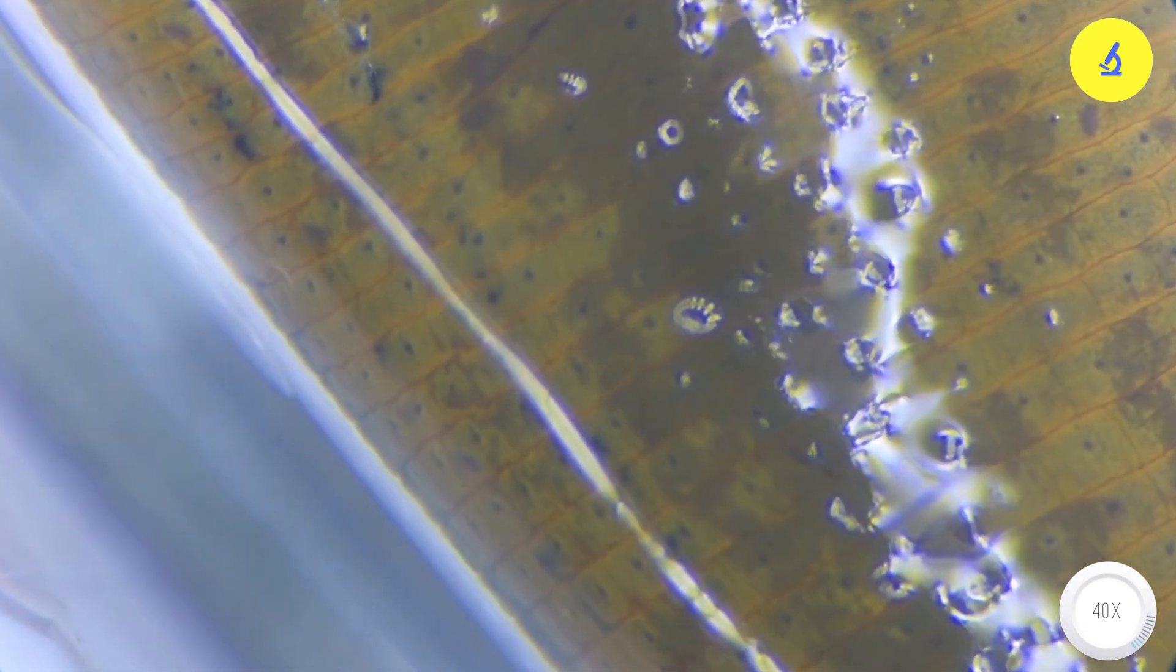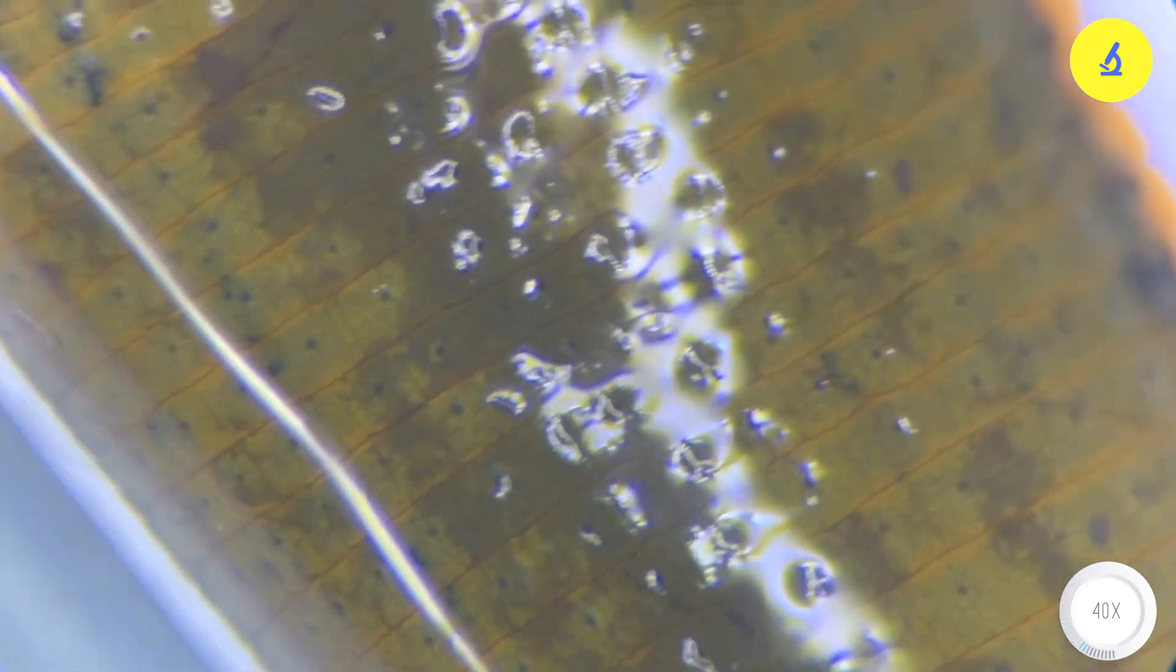We are observing this leech under 40x magnification. It is elongating its body and moving like a measuring worm. Its body is flattened along the dorsal ventral axis and has black spots on each segment, totaling about 33 to 34 segments. Its body is very long, smooth, and covered with a layer of slimy, lubricating substance on the outer surface. This slimy fluid is secreted by the leech's epidermal cell layer.